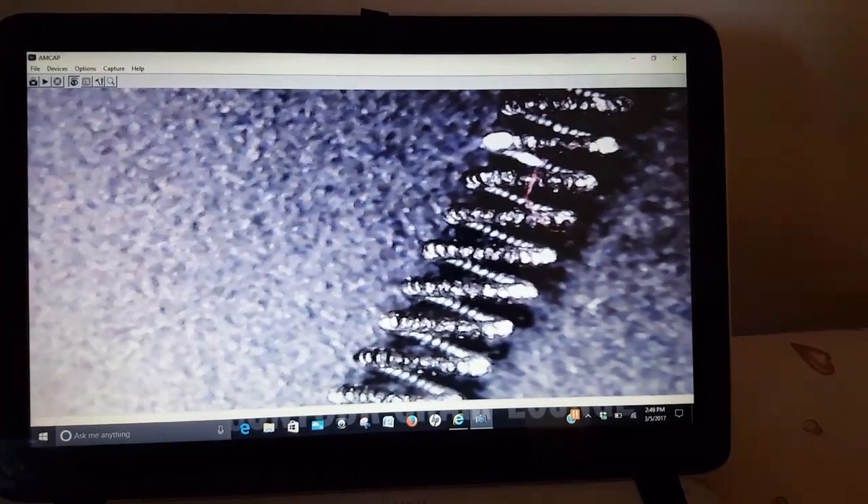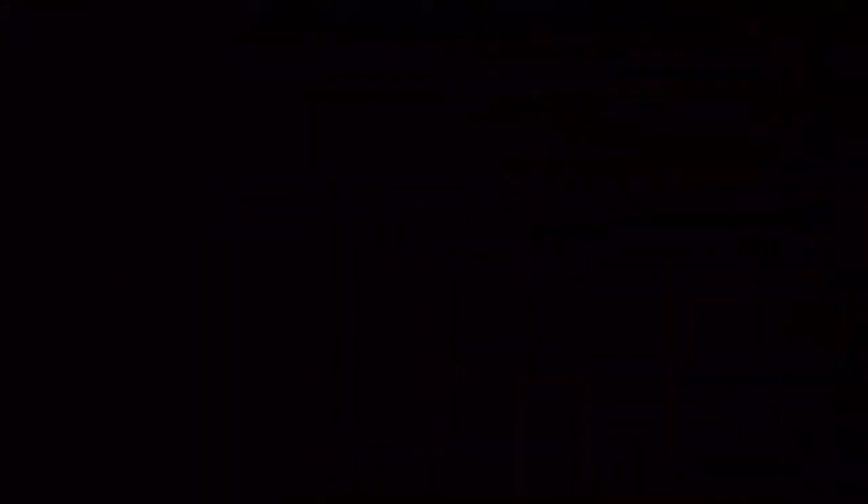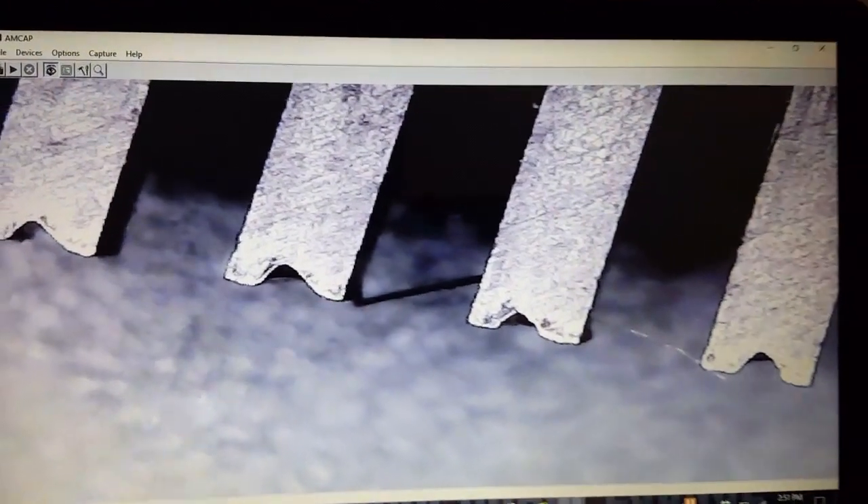That right there is a filament from a broken light bulb — I just thought it would be interesting. It's a coil made into a coil. I wasn't aware of that. This is a close-up of my thinning shears. Each tooth on the thinning shears has a V-notch cut into it that selectively grabs hair. Pretty cool.